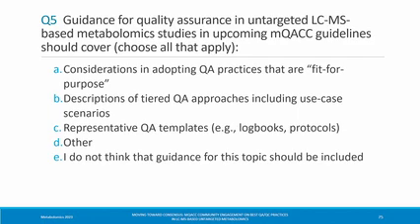Next up, if you're a professional lab, you want to monitor those things. And then a third tier could be some of the things that go along with only certain circumstances, auditing, ring testing. Sorry, I meant proficiency testing. That was Freudian, I guess, in a way, because the academic version of that is ring testing, right? So I would put some of those things perhaps in a third tier, but it's a bit of a stretch to do so.